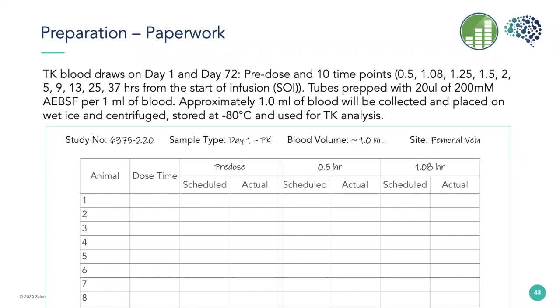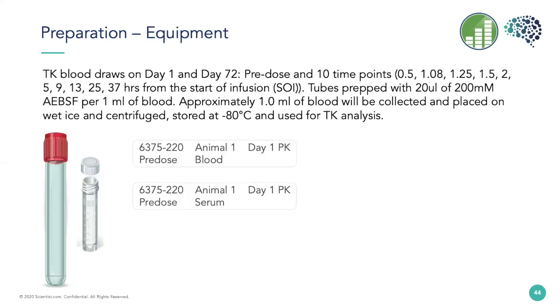So if you think there are 11 collections, when you count up these time points on the 2 intervals, that's 4 pages of time points with 2 pages of animals and 2 intervals, or 16 pieces of paper that need to be prepared and filled out individually.